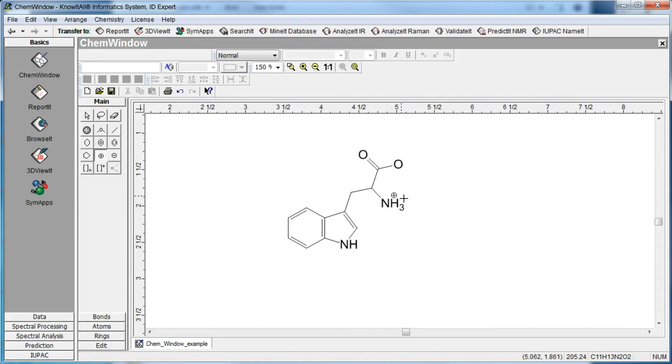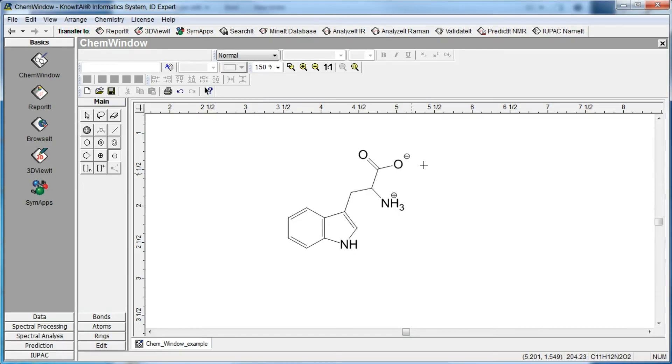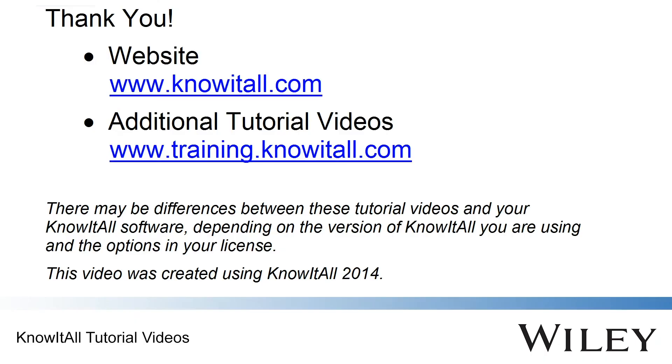Use the same procedure to add a negative charge to the oxygen atom. This concludes our demonstration of how to draw a chemical structure in the Know-It-All informatics system.